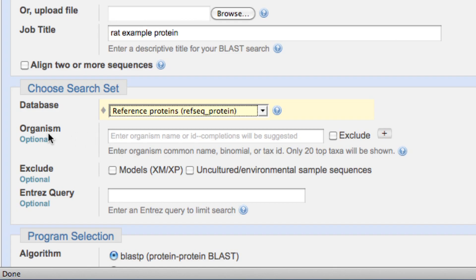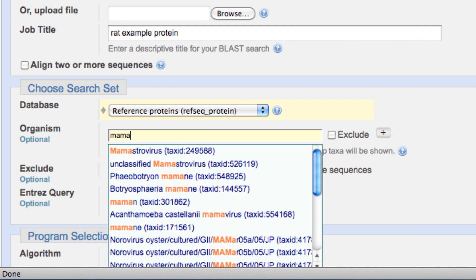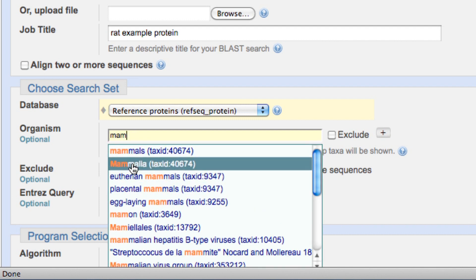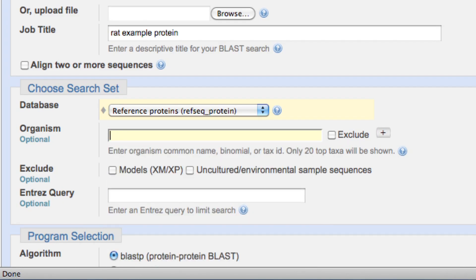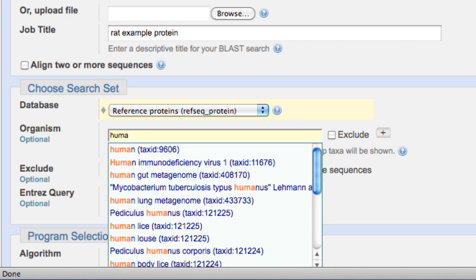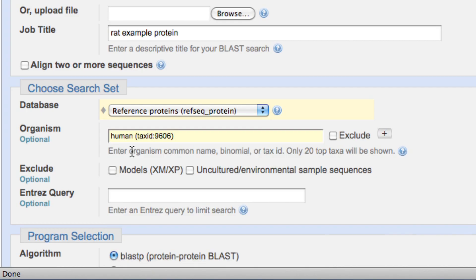The third thing I want to show is the organism line. I can limit my output to a specific organism or a series of organisms. For instance, if I start to type out mammals, you see that mammals becomes one of my choices. I'm going to limit to human sequences, so I can just type human. I can use the Latin name as well — Homo sapiens — but human will work.